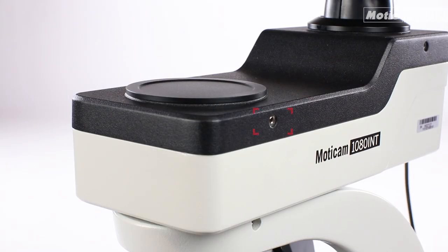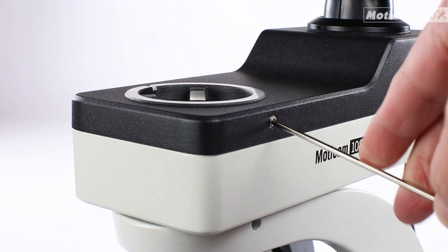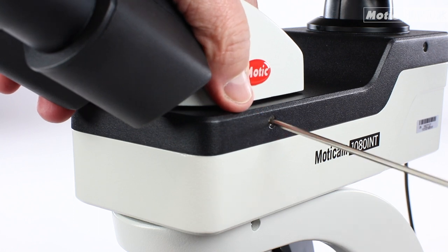Now we remove the black cover and place the microscope head back, holding it by tightening the fixing screw with the Allen key.